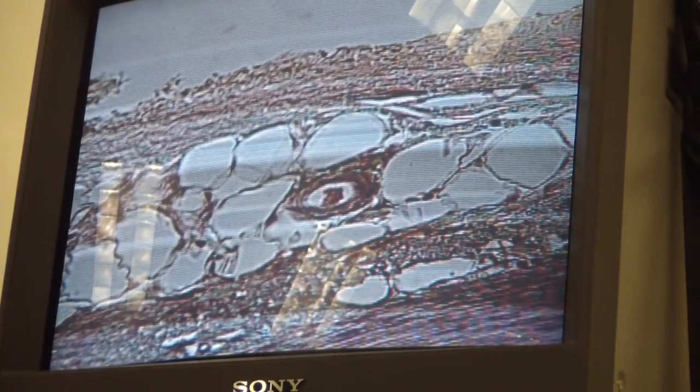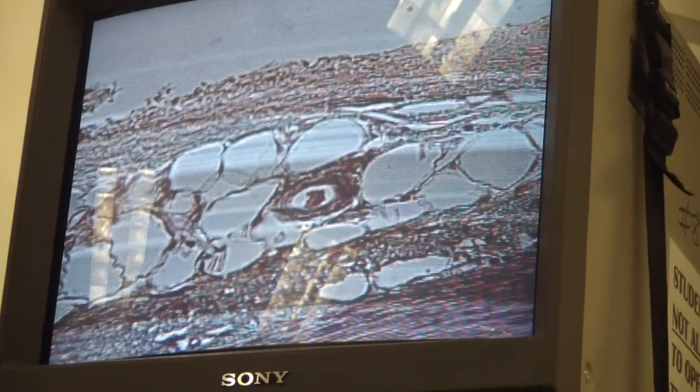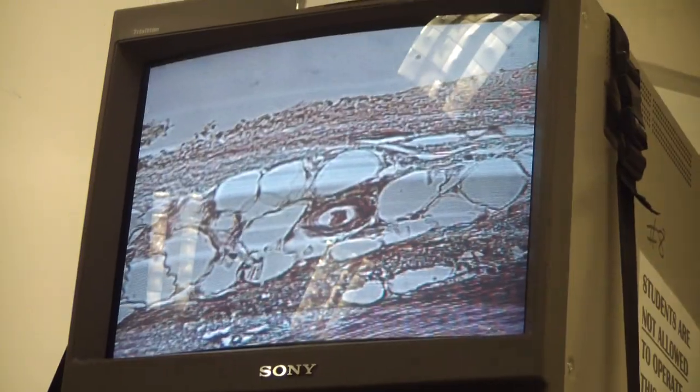Then of course you see some collagen fibers, you see some adipose. This is a huge capillary right here, as you see the blood is inside. You should be by now, you should be expert when you look at the particular slide. You should know where the epithelium is, where the muscle is, where the nerve is.